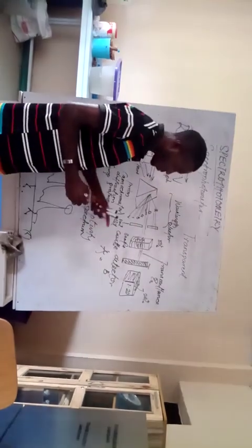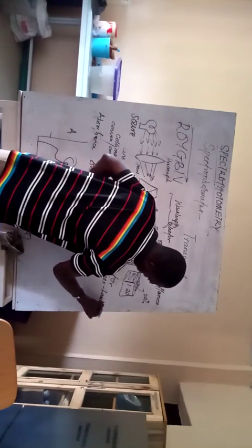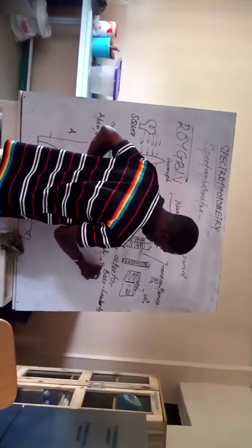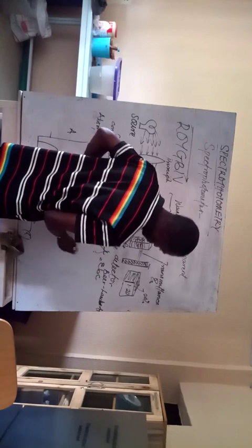That is why the absorbance is given by a formula according to the Beer-Lambert law. The Beer-Lambert law basically says that the absorbance of a material is directly proportional to the concentration of that material, and also directly proportional to the coefficient of absorptivity.